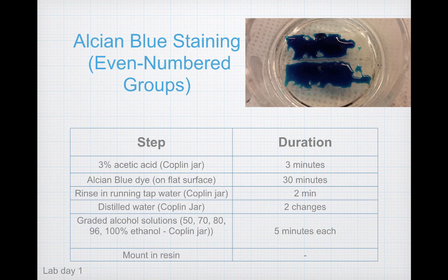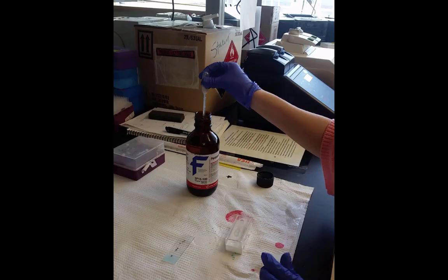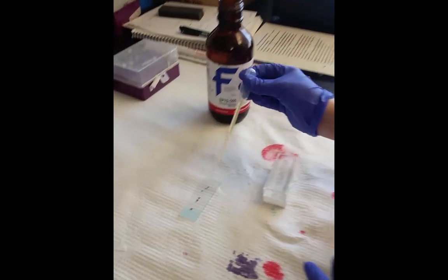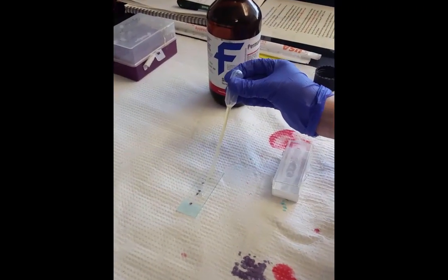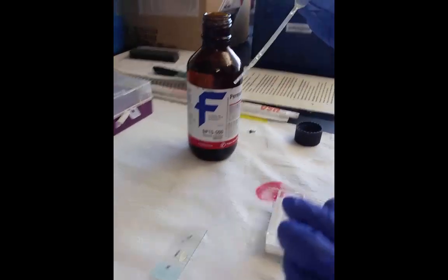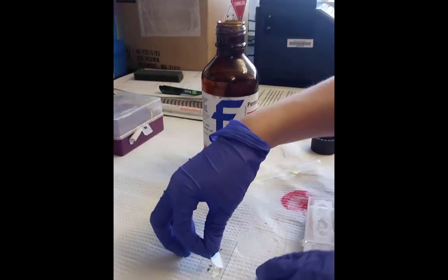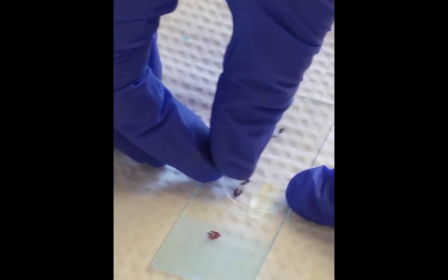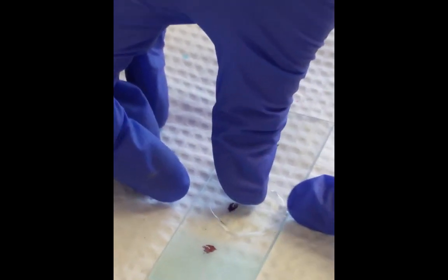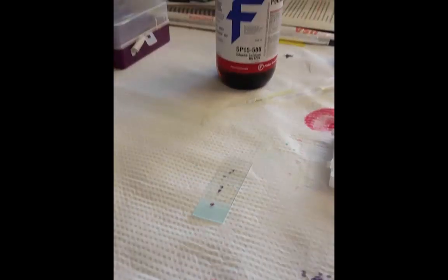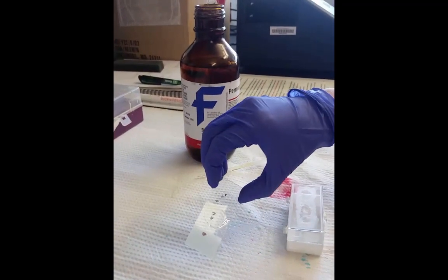Finally, mount your specimens in a synthetic resin called Permount. Mounting is important to preserve and support the stained sections during light microscopy. Pipette the Permount onto the bottom of the slide, then carefully place a thin glass coverslip over top. The pressure of the coverslip will cause the Permount solution to spread over your samples — try not to get any bubbles in there because that will cause optical distortion during microscopy.